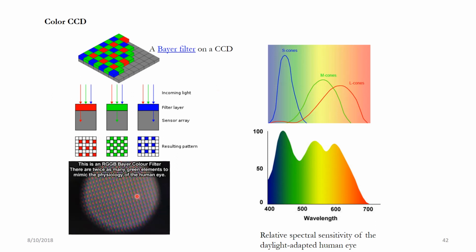And this is the close-up image of your screen. That's how RGB is looking on your screen, so that way you can actually see the colors. So it's a great way to visualize colors, but it's a wasteful way for a microscopist, because you are going to waste a lot of light and waste a lot of detector space. So it's always a good idea to use a monochromatic camera with a filter in front of it, and you can switch the filters and then collect light. That way you are not wasting the precious fluorescence light.